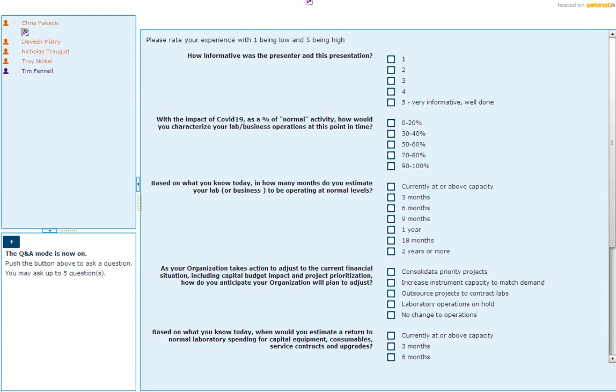How do you actually relate the stress-strain test to the drop test? The strain rate in the drop test must be at least an order of magnitude greater than what you can achieve on the ElectroForce instrument. Yeah, so that's a great question, because you think impacts happen really quickly, and so I'll maybe mention a couple of things.